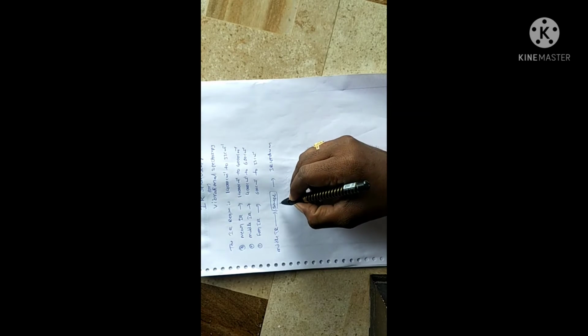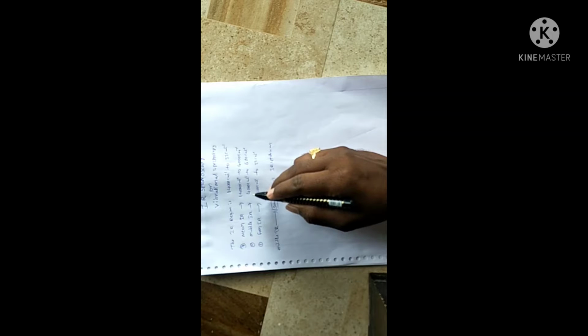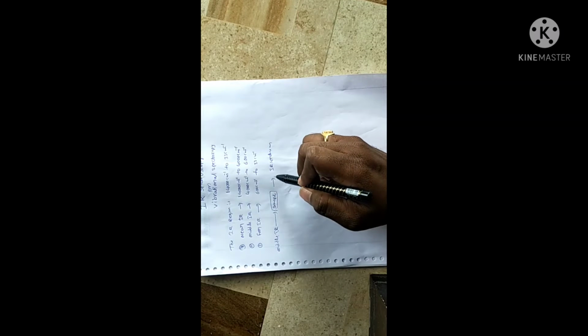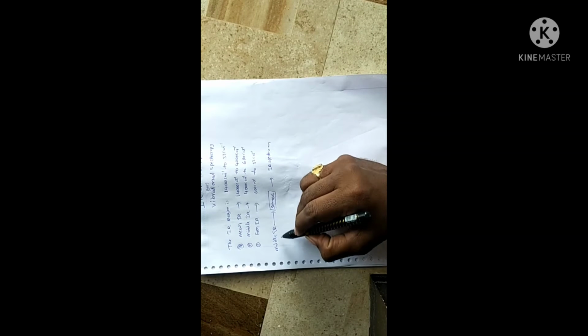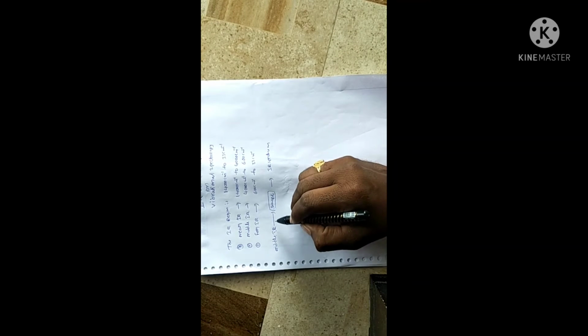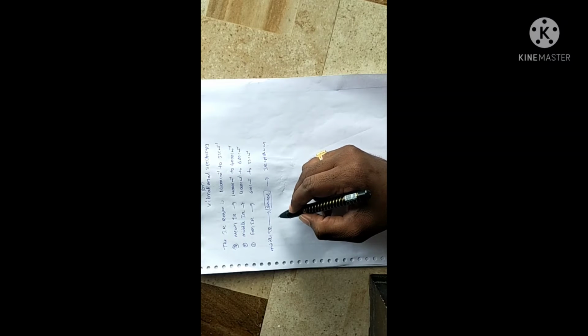Means the sample is irradiated with the middle IR range of radiation or frequency, and once we are irradiating this sample with the middle IR, in this molecule the vibrational energy levels will change.